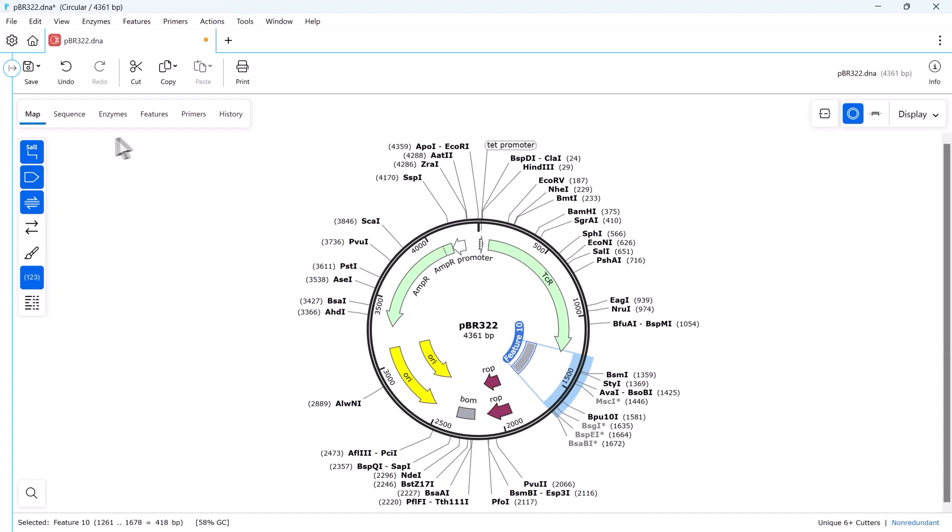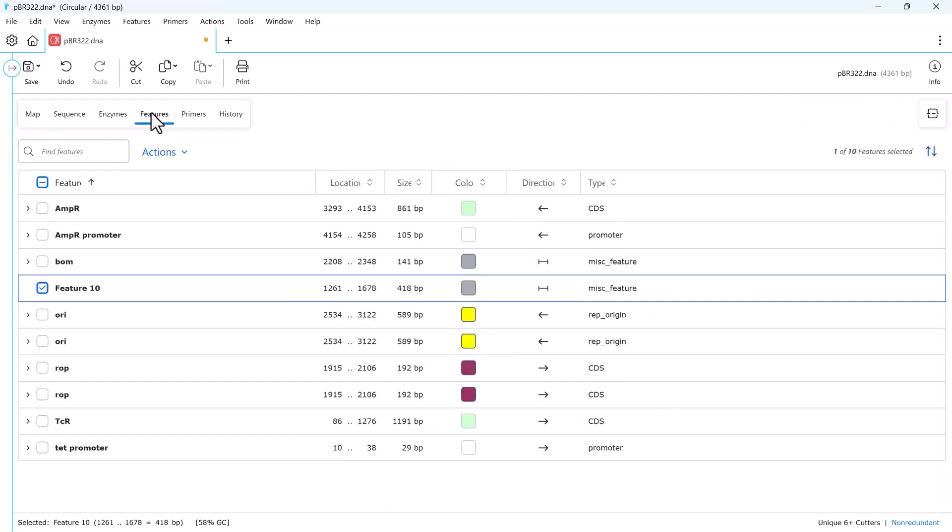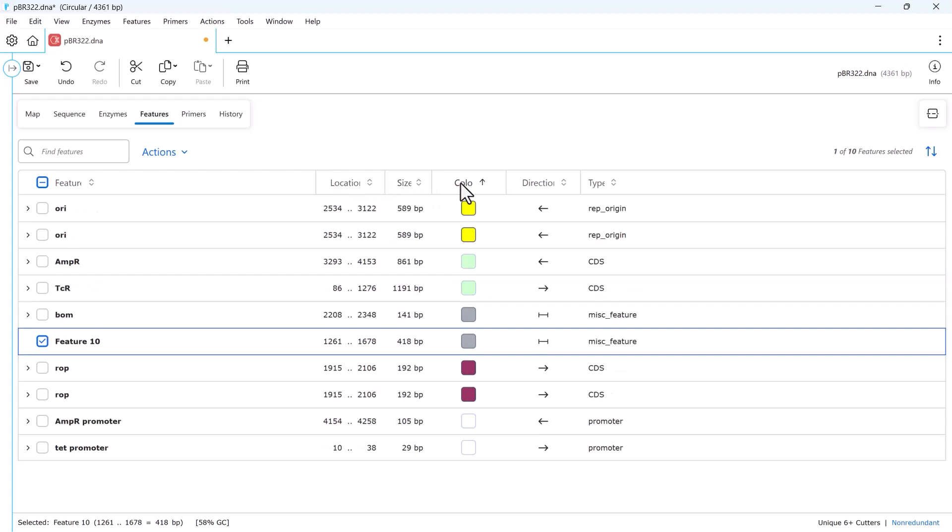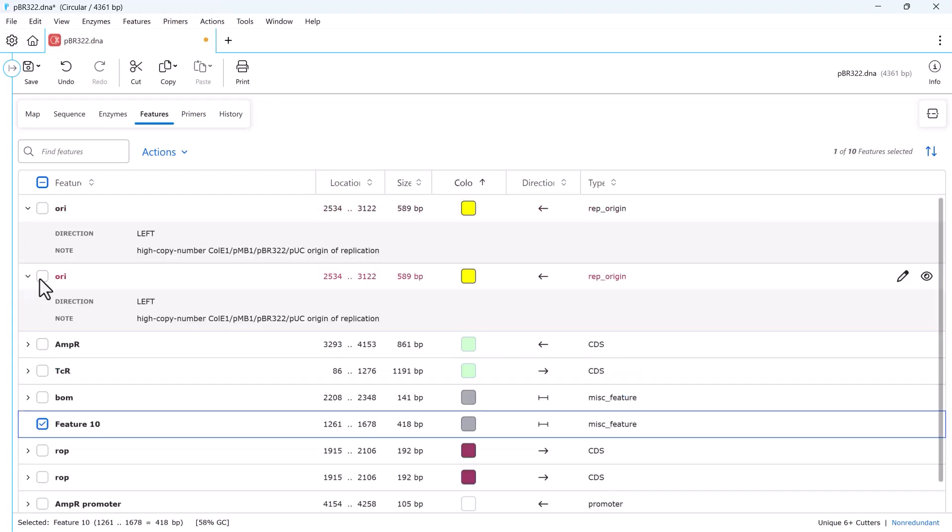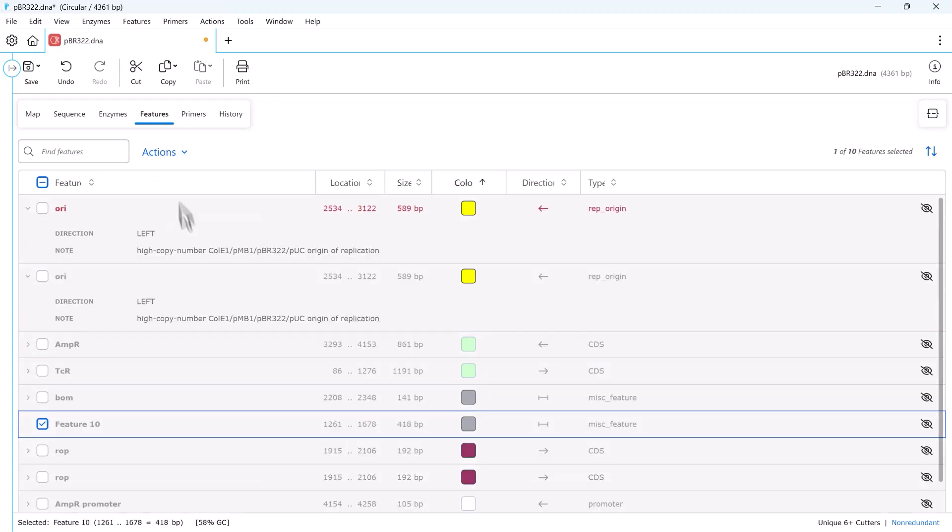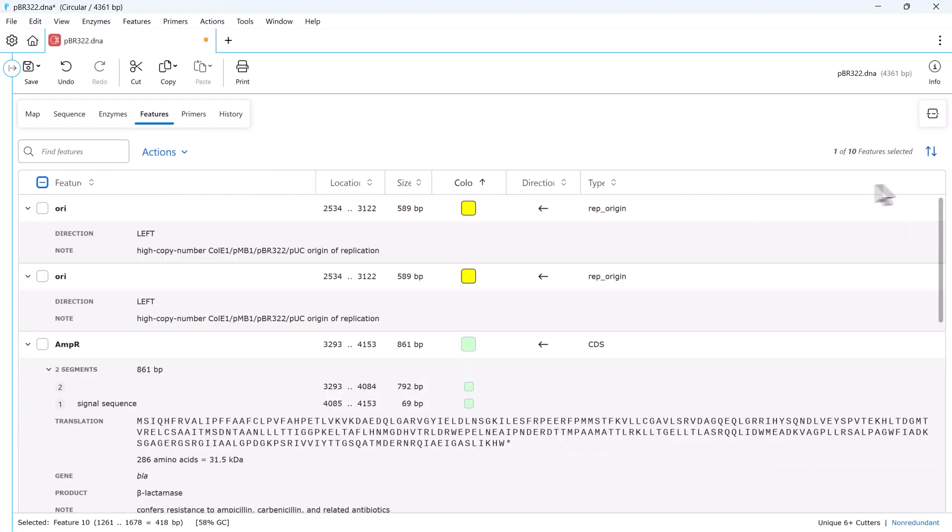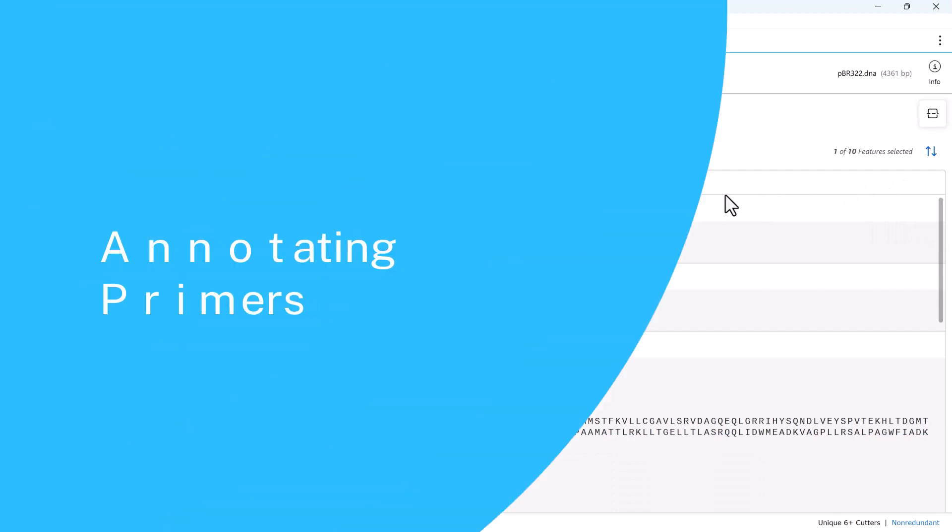To see a complete list of the features in your sequence, simply click the features tab. Here, you can sort or search features, expand to show feature details in full, or hide and show features individually or in bulk. You can click the right button to expand, collapse, or sort all rows.